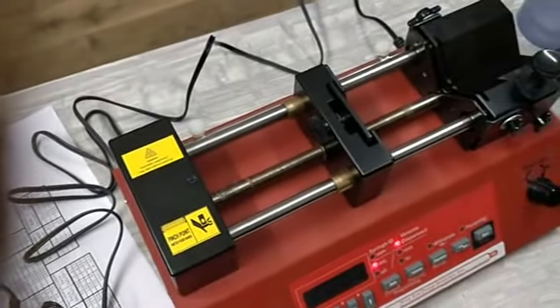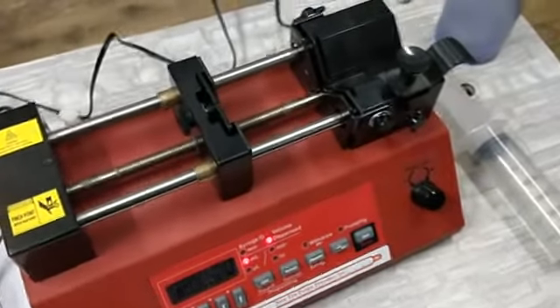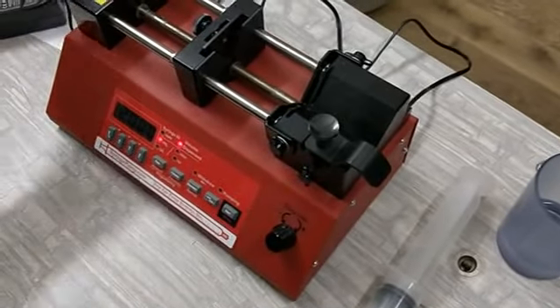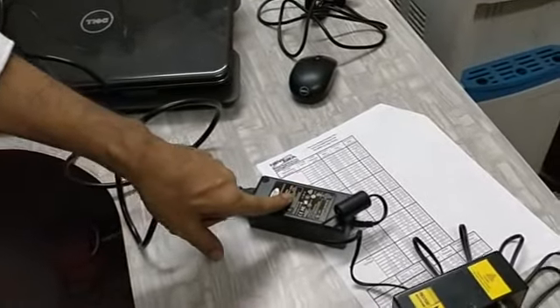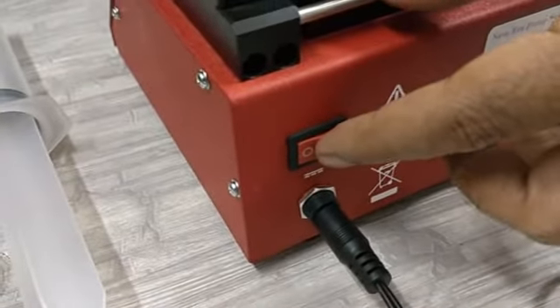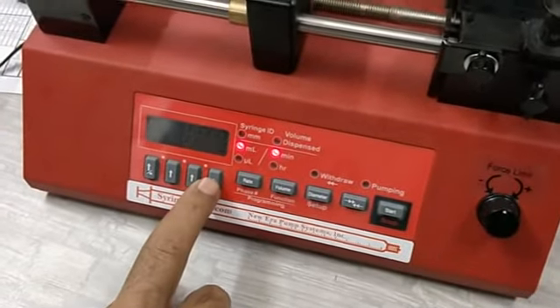Here we are giving a small demo of how to run the machine once you get it in the lab. The first thing we will do is fix up the power. The power goes to the 24 volt DC adapter, and here is the 24 volt pin and the on/off switch. I am putting the power on now. Once you put the power on, you see that the digits are flashing — press any key and they will stop.